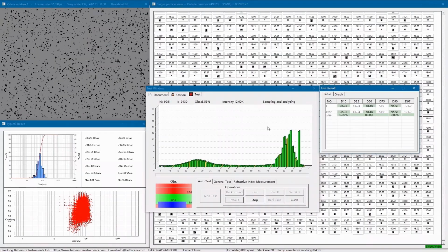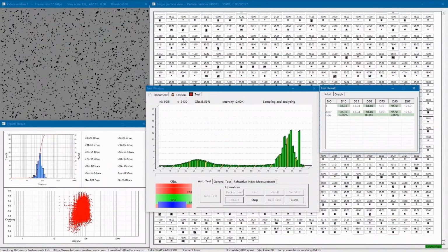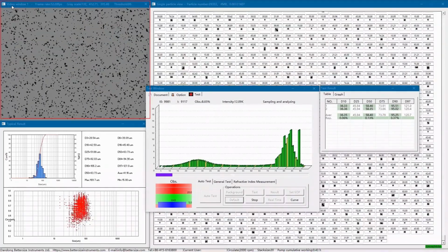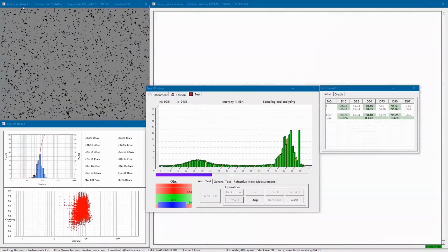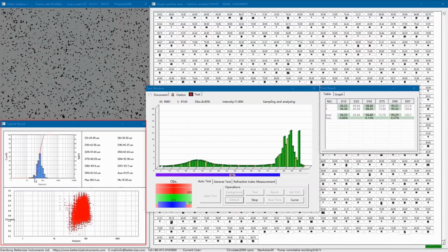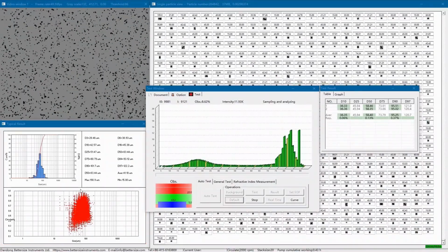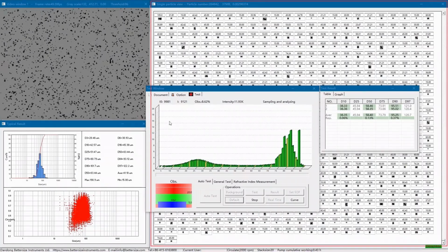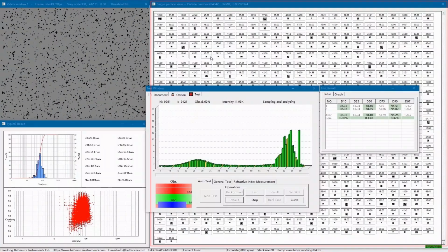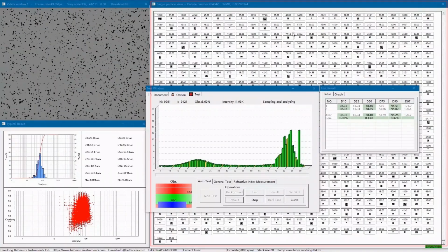On the other hand, the other windows belong to another system, the image analysis system of the Bettersizer S3 Plus. The upper left window is the real-time shooting video, and the lower left window is the real-time analysis result, including a histogram, typical values, and a scatter plot. And the right window is the individual particle image, which shows the image results. All the windows are provided by the image analysis technique.